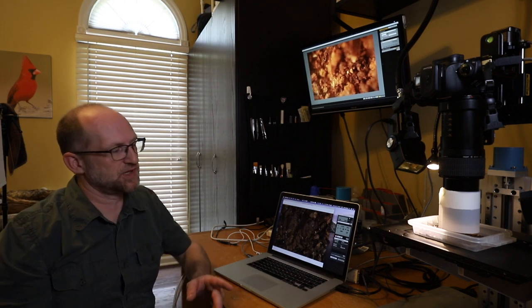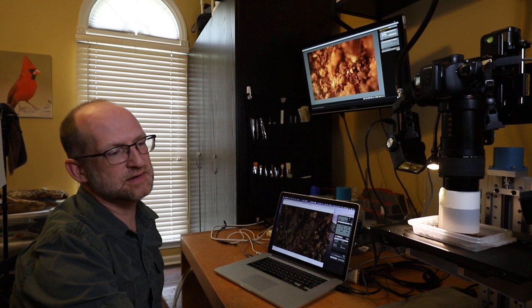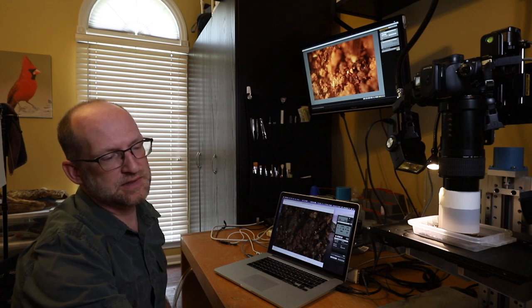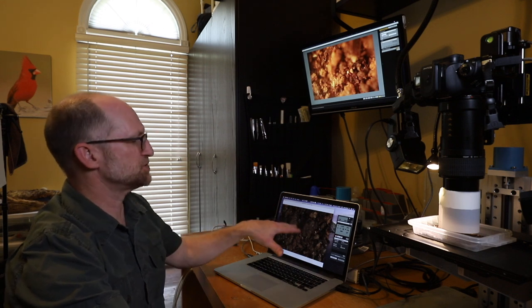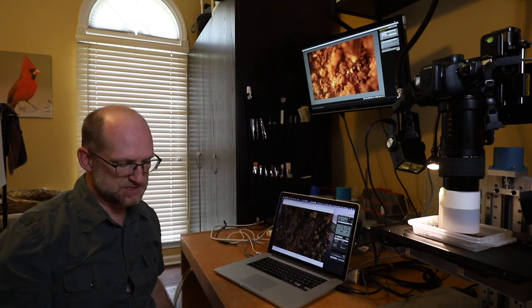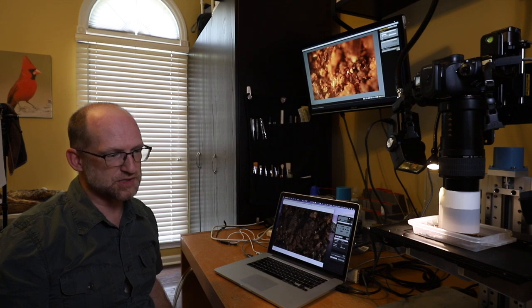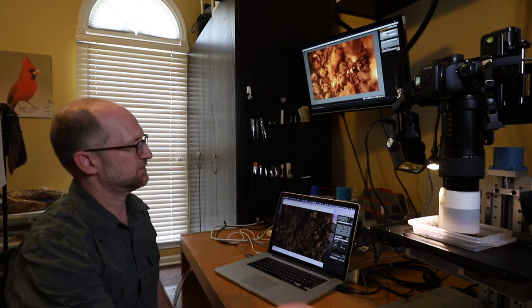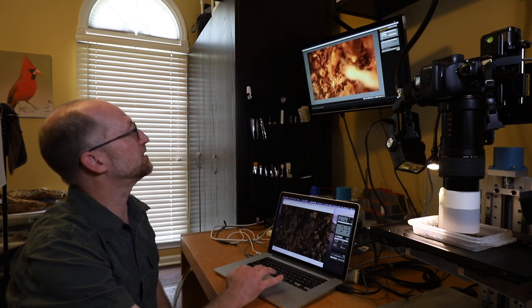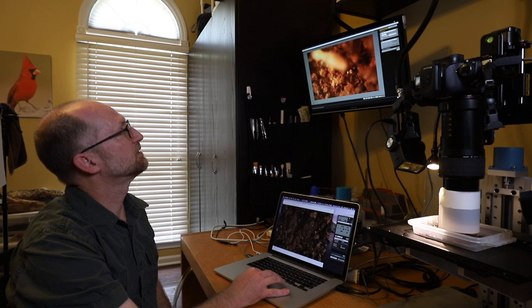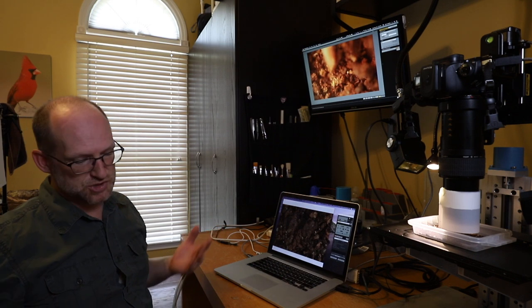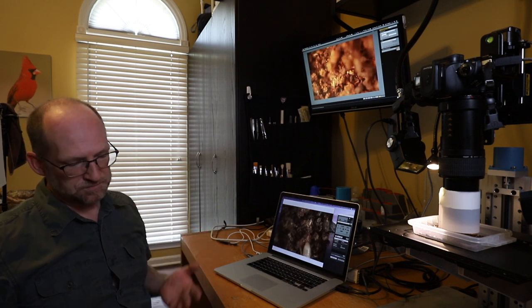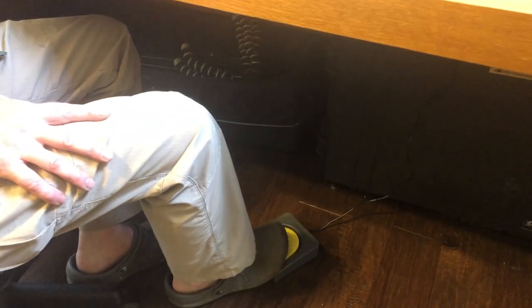I'm using a foot pedal to actually take the exposure. That way I don't have to move my hand from the joystick or do something with my left hand up here. I can just take a picture as long as I'm on the window, I can just take a picture by pressing down on the foot pedal. This is just a USB device.